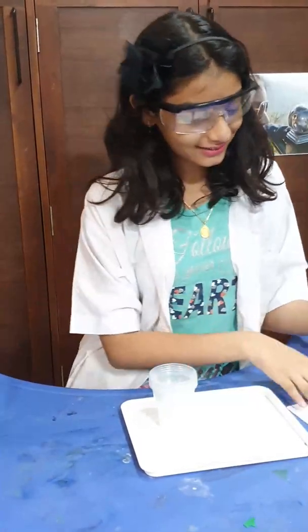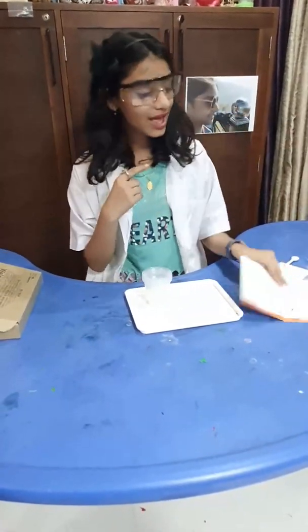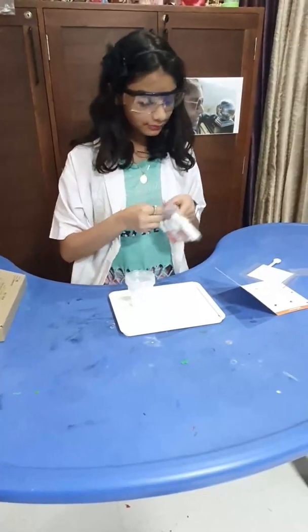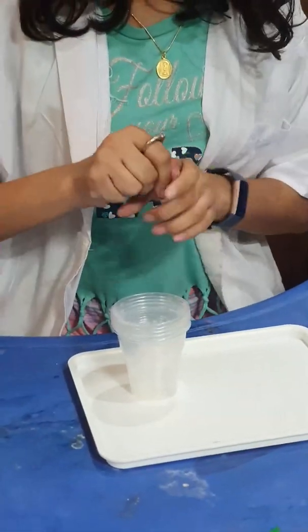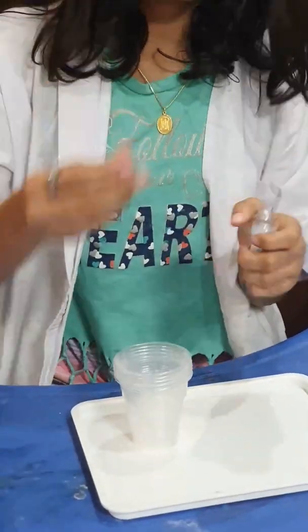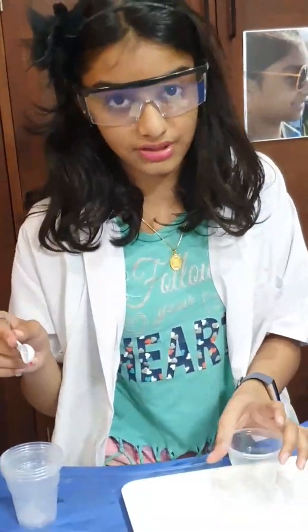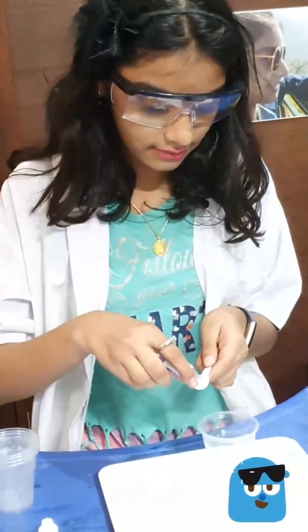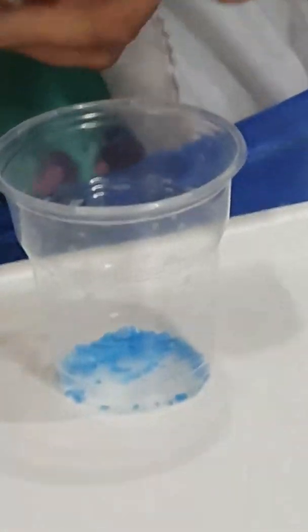Today we are going to meet with CuSO4 — nice! I'm using reused cups because they are plastic and plastic is non-biodegradable, so we need to reuse it more. One big spoon of CuSO4 and then one more big spoon.